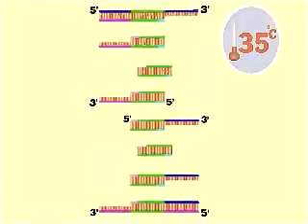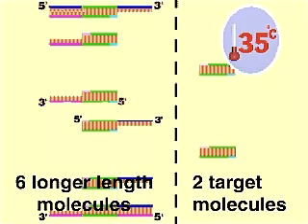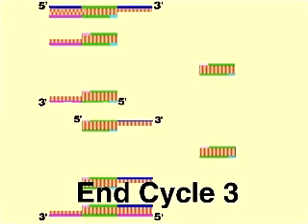Cycle 3 produces 2 doubly stranded molecules that contain only the target sequence, as well as 6 longer molecules that contain the target and flanking sequence. In subsequent cycles, the number of target sequence molecules will increase exponentially.